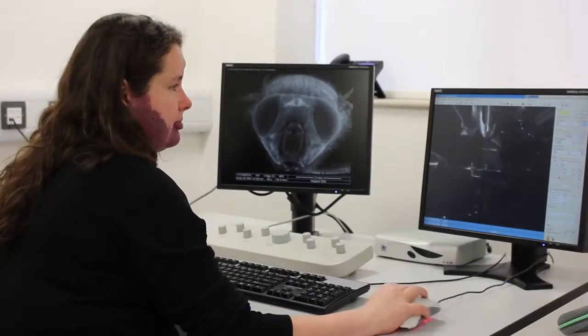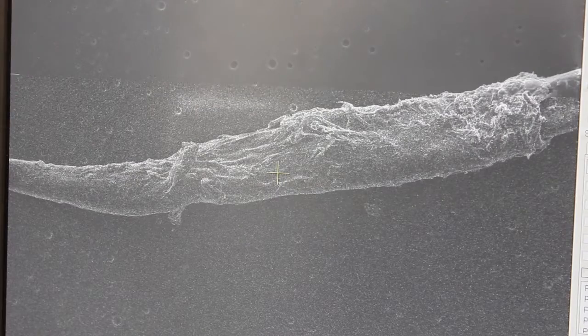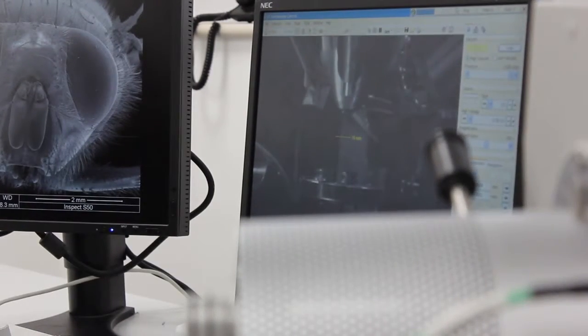One of the areas that we're looking at is fine particulate matter, and we can do that with the additional piece of equipment we have, the EDX, or Energy Dispersive X-ray. That allows us to not only look at the particles themselves under the microscope, but actually identify the types of materials they're made of.